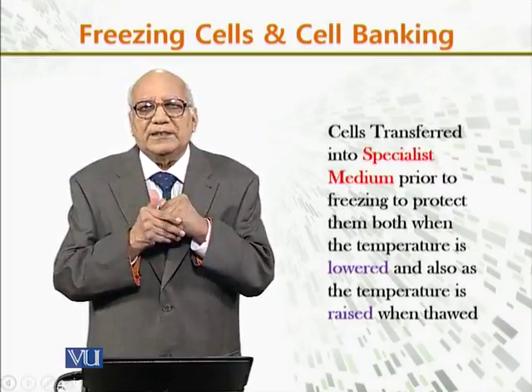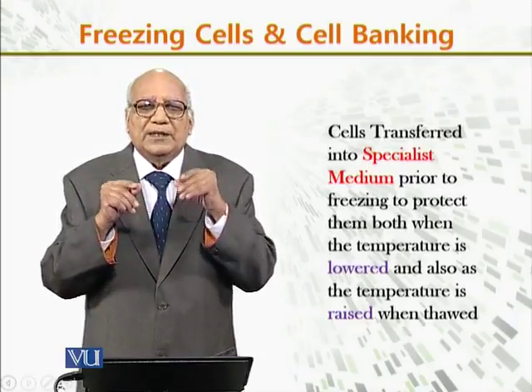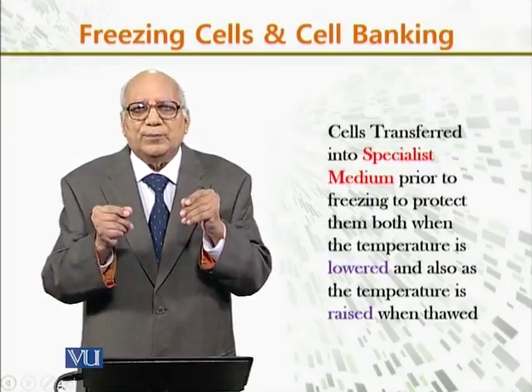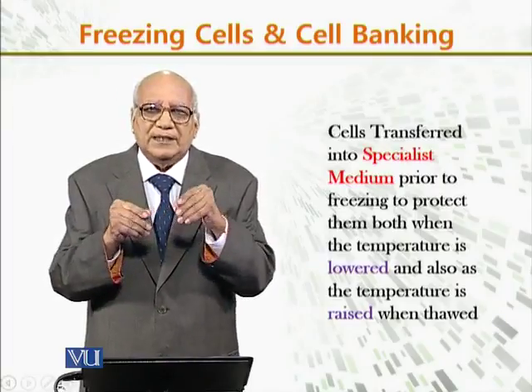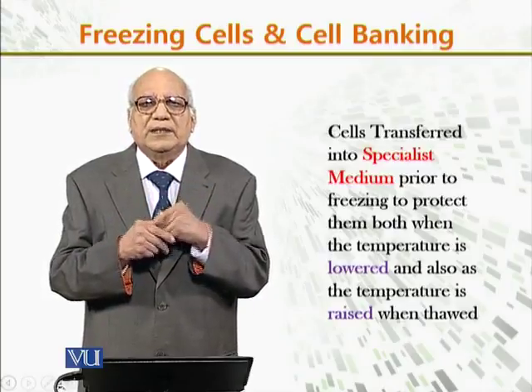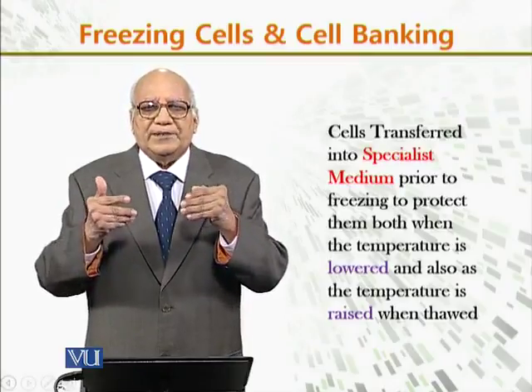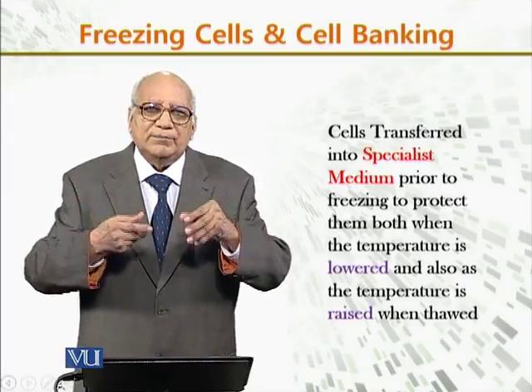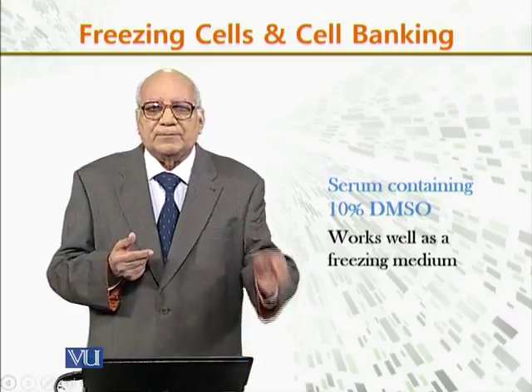So during freezing, there are two processes. One is putting them into a specialized medium, then freezing them at a very low temperature. And again, while using them, we have to revive them by raising the temperature so that they are thawed, they are melted, and they are used for this purpose.